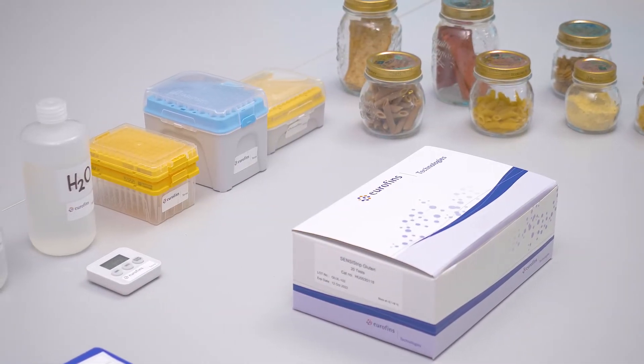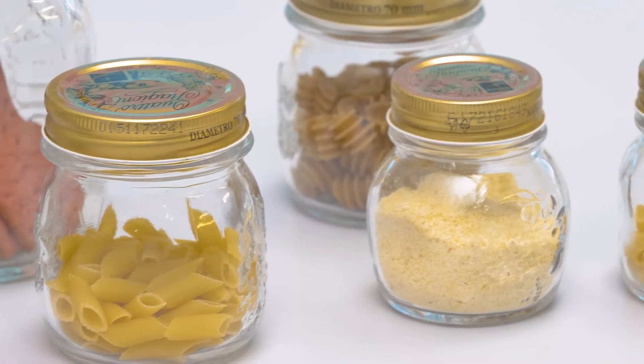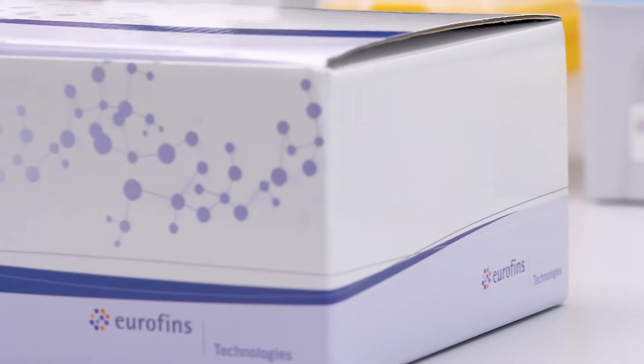Gluten-free food manufacturers need to verify ingredients, finished food, work surfaces, and rinse water with reliable, sensitive, and easy-to-use analytical kits.